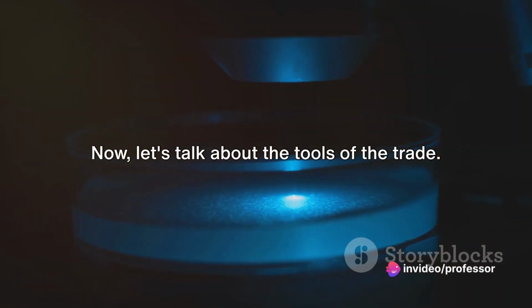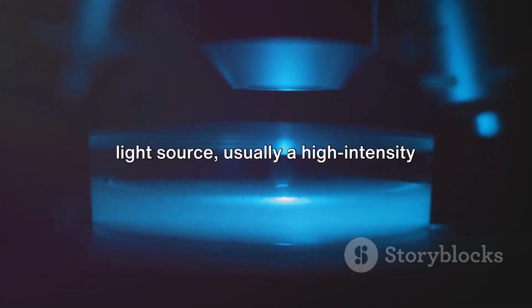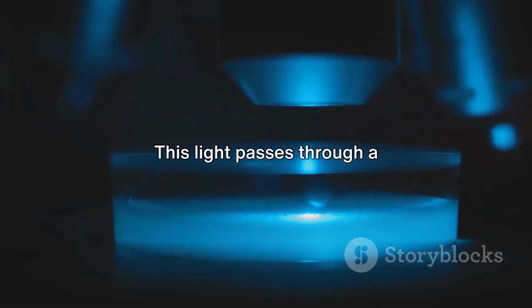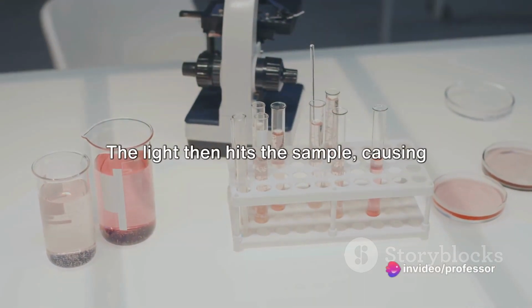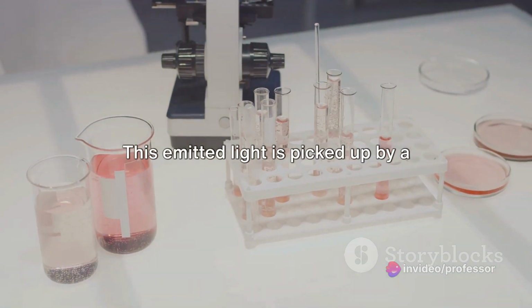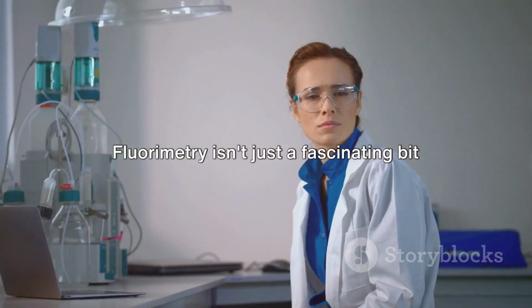Now, let's talk about the tools of the trade. In a basic fluorimeter, you'll find a light source, usually a high-intensity lamp, to provide the excitation energy. This light passes through a monochromator, which selects a specific wavelength. The light then hits the sample, causing it to fluoresce. This emitted light is picked up by a detector, which measures the intensity of the fluorescence.